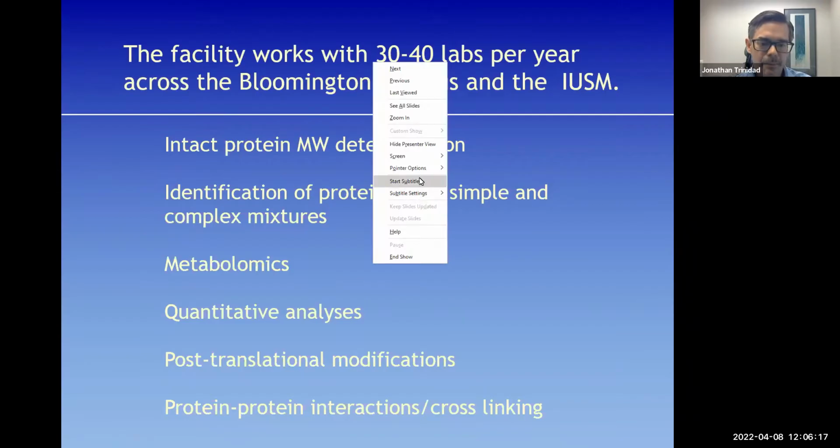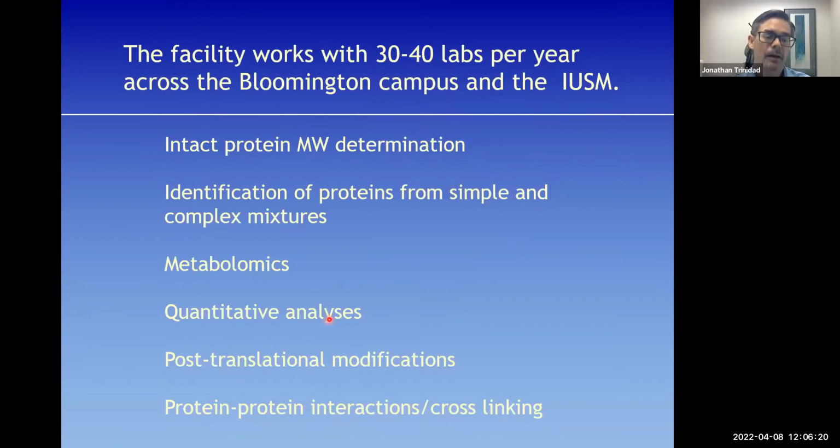Quantitative analysis is really useful, right? You can just layer that on top of your protein characterizations, and depending on, of course, the assay, that will tell you a lot more about what's going on. In general, my real research interest is post-translational modifications, and as a corollary, looking at protein-protein crosslinks, either native links such as disulfide bonds, or more commonly chemical crosslinking to get some crude three-dimensional structure for protein complexes.